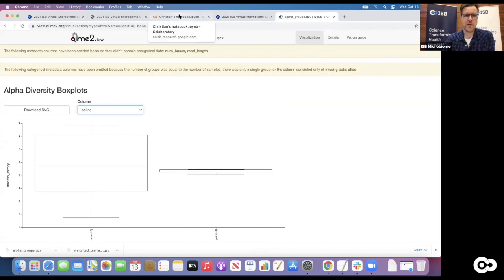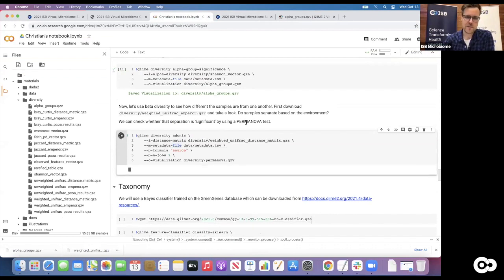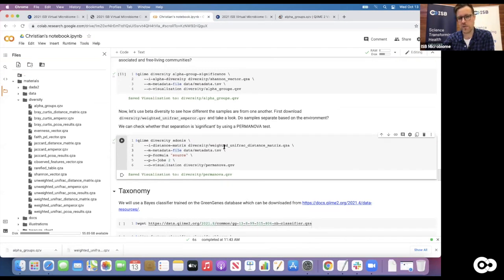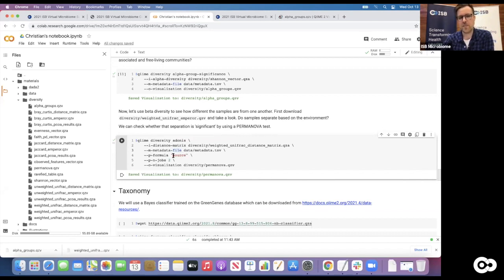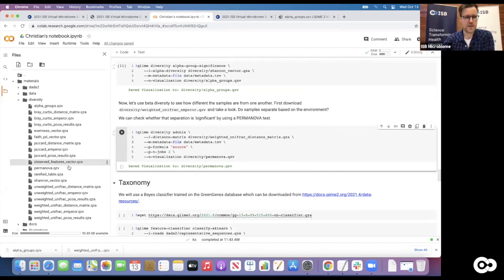We can do something similar and run PERMANOVA for the beta diversity to see how much of the inter-sample distance is actually explained by covariates like the source the sample came from. That is run with the diversity plugin using an action called 'adonis' - adonis is the name of the algorithm that runs PERMANOVA. It takes a distance matrix rather than an alpha diversity measure. We use the weighted UniFrac again, provide the metadata, and provide a formula - in this case just the name of the covariate we want to test for statistical significance, which is 'source' - the environment the samples came from.